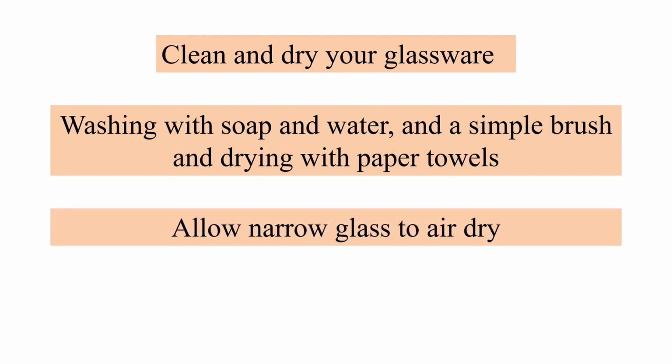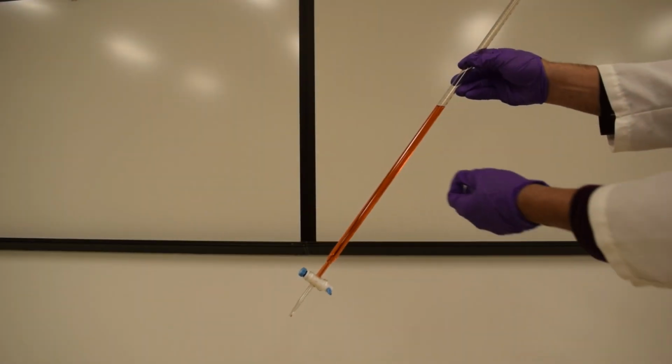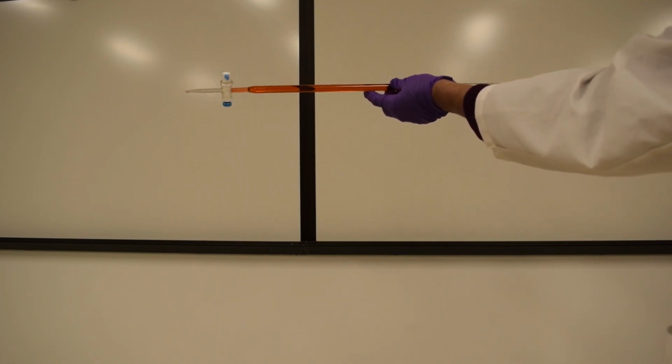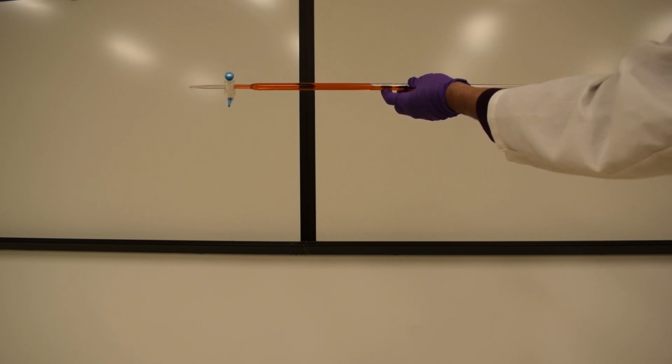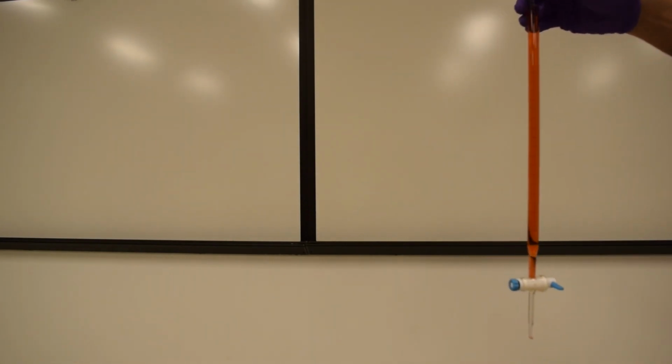Either way, you will always run your sample solutions through your glassware before use. For example, you would add some solution to a buret. You would tilt the buret at an angle and rotate it so that the inside of the walls are coated with the solution, then dispose of the solution in a waste container.